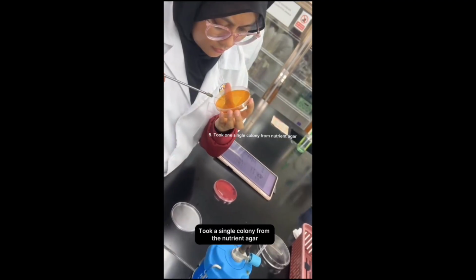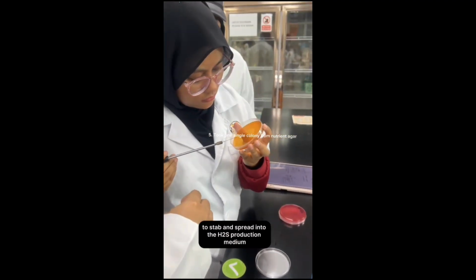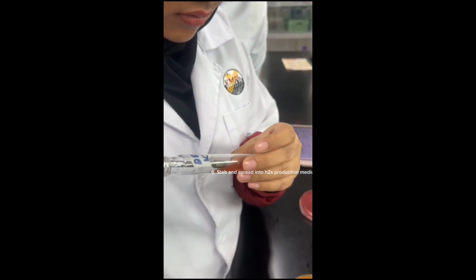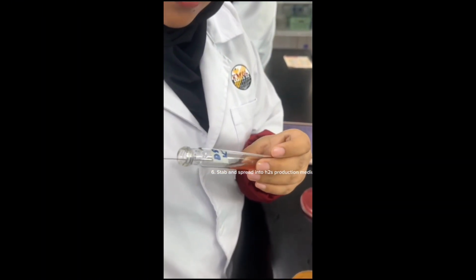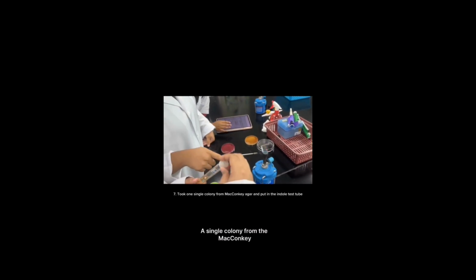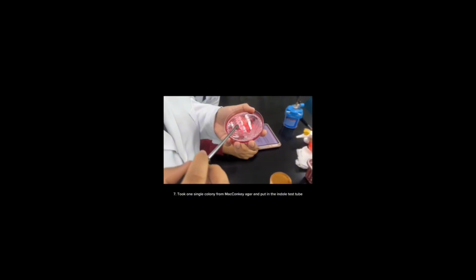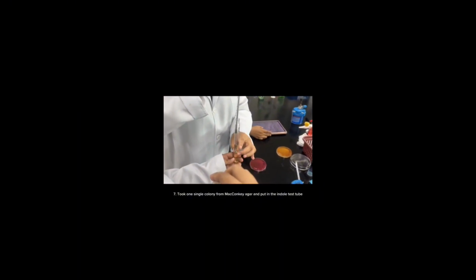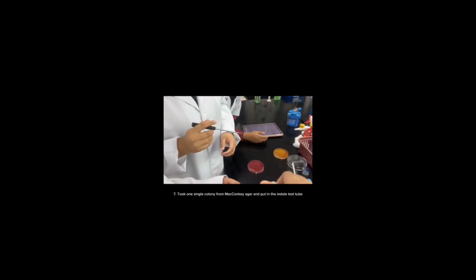Then the agar was incubated for 24 hours at 37 degrees Celsius. Take a single colony from the nutrient agar to stab and spread into the H2S production medium. A single colony from the MacConkey agar was taken and placed in an indole test tube. Then the agar was incubated for 24 hours at 37 degrees Celsius.